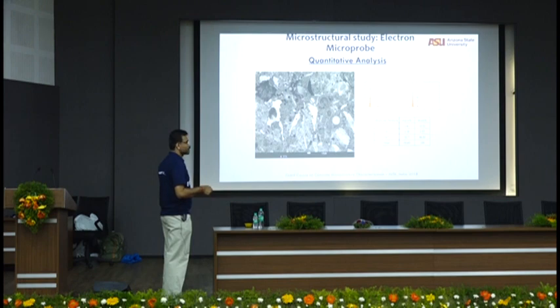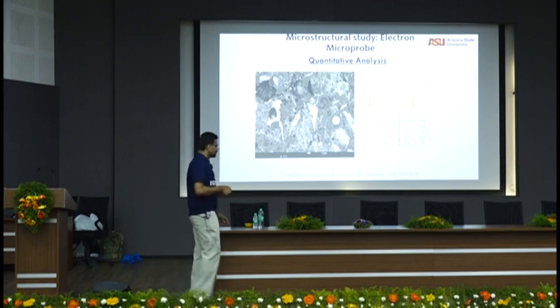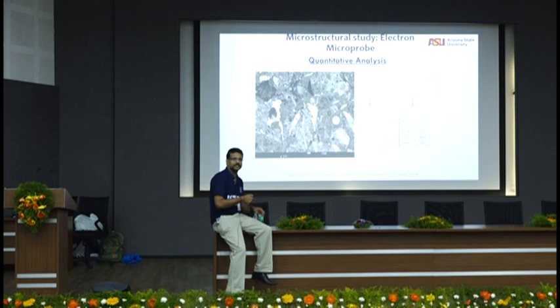Mass percent is not matched 100%. Anybody want to suggest the reason for that? Atom percent is matched, but mass percent not matched. Which one would be correct? Which one would be more correct?